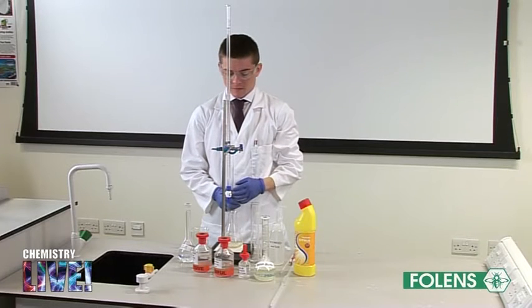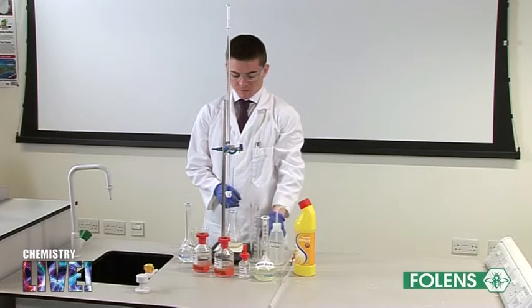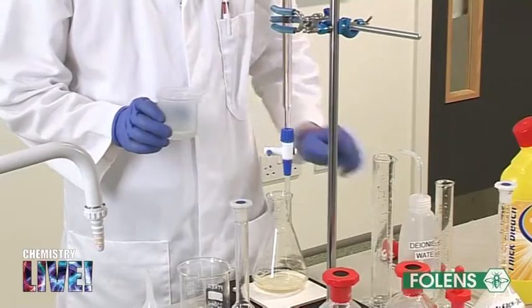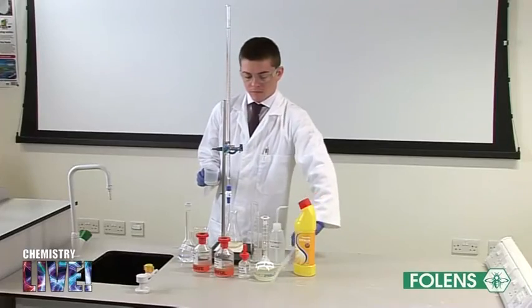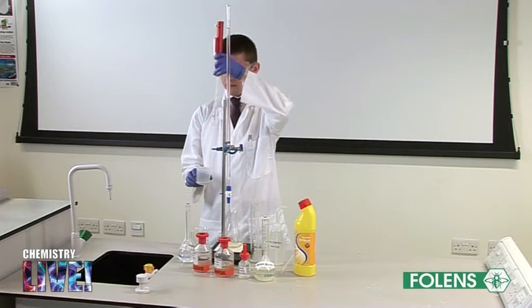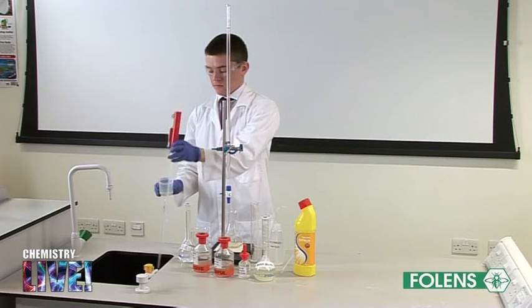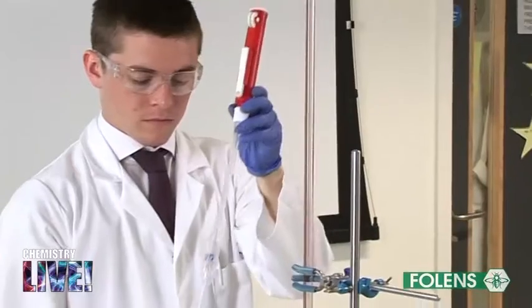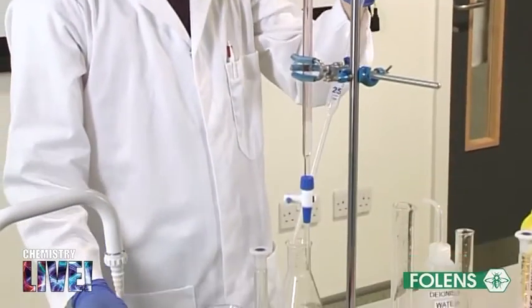100 cm³ approximately of the diluted bleach was poured into a beaker. Using a pipette filler, the pipette was washed with a small amount of this solution. Then, using a pipette filler, 25 cm³ of the bleach solution was pipetted into the conical flask.